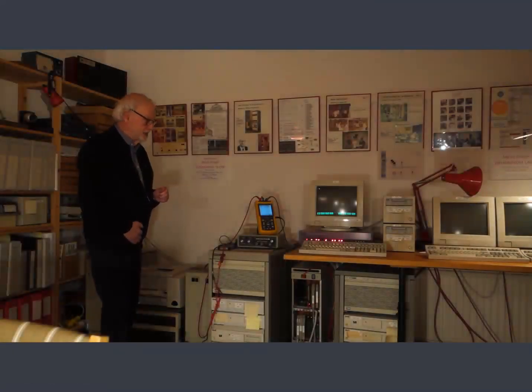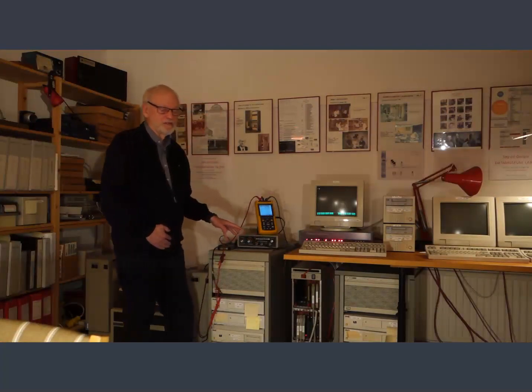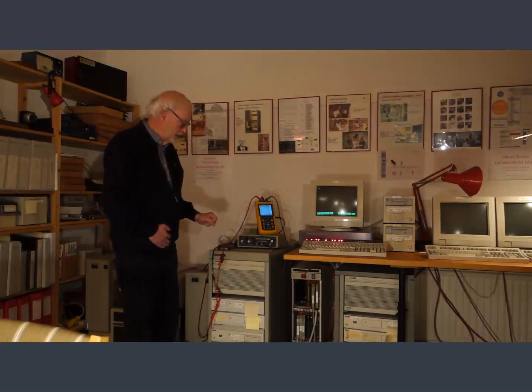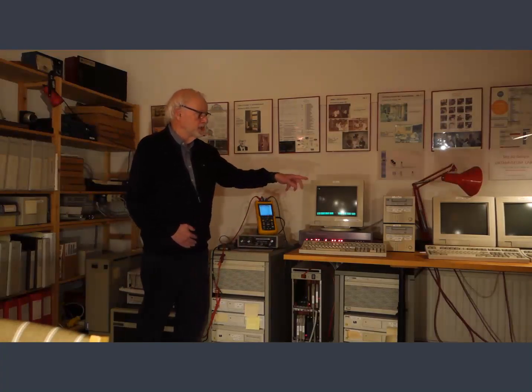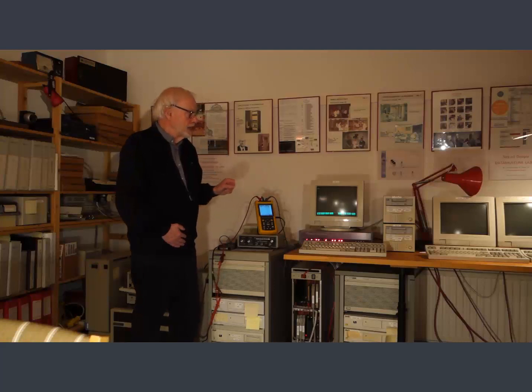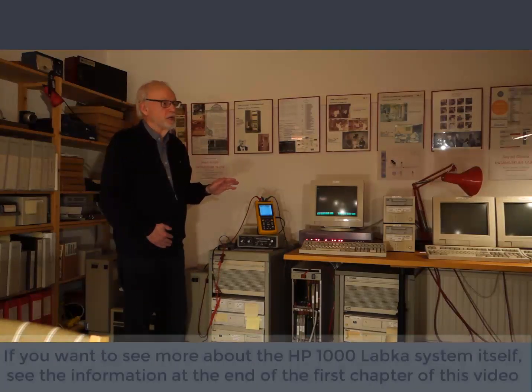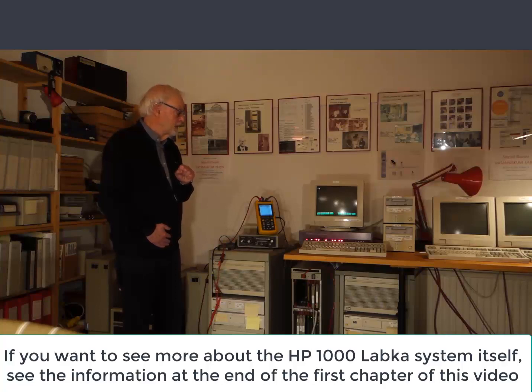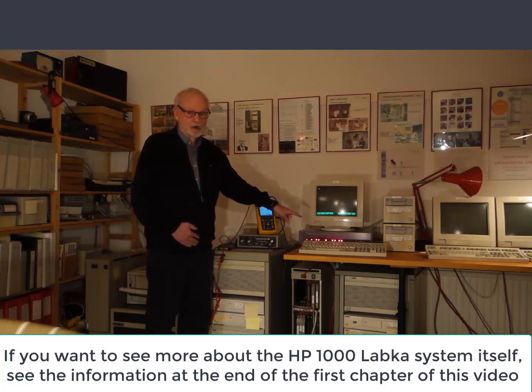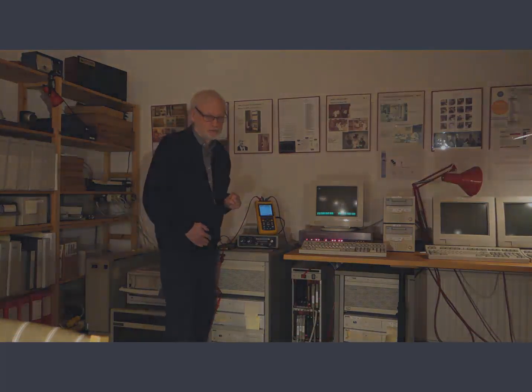Here you see the CSI 101 controller. And here you have the HP1000 lab system: the computer, the disk, tape units and some terminals. If you want to get more information about the system, you should go to the information just after the first chapter in this video. But here we shall concentrate on the CSI 101 and communication. So let us take a closer look.